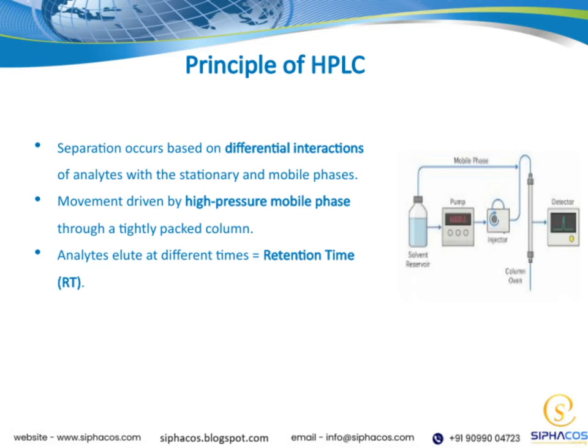Separation occurs based on the differential interactions of analytes with both the stationary and mobile phases. Essentially, different compounds will interact differently with these phases, which allows us to separate them effectively. The movement of these analytes through the system is driven by a high-pressure mobile phase that is pushed through a tightly packed column. This pressure ensures the mobile phase flows steadily and efficiently, carrying the analytes along.